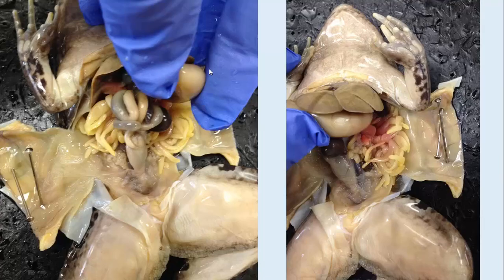In this next picture, what I did was I lifted up some of the organs that hang over, and you can see the fat bodies much better. You see the finger-like projections coming around on either side of those organs. On this picture, I lifted up the organs on one side, so you can see how those structures are attached to the top over here.